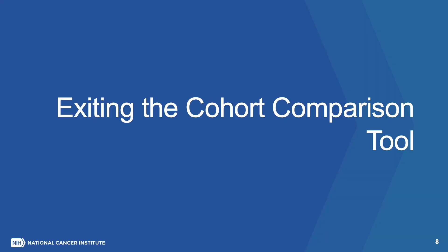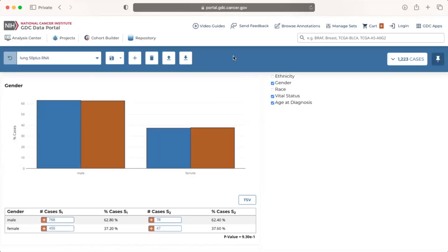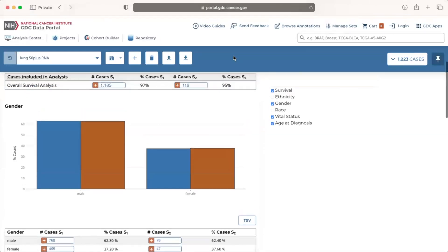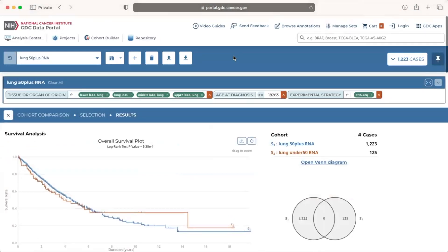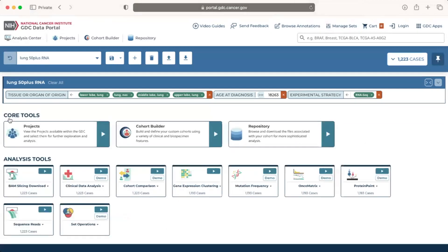Exiting the cohort comparison tool. To exit, we can click the X button to the left side of the cohort comparison header which will bring us back to the analysis center.